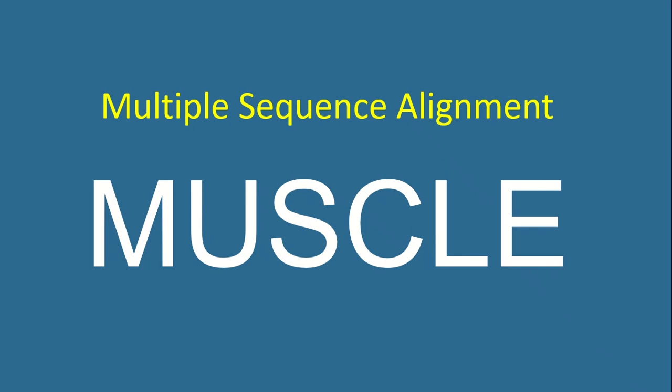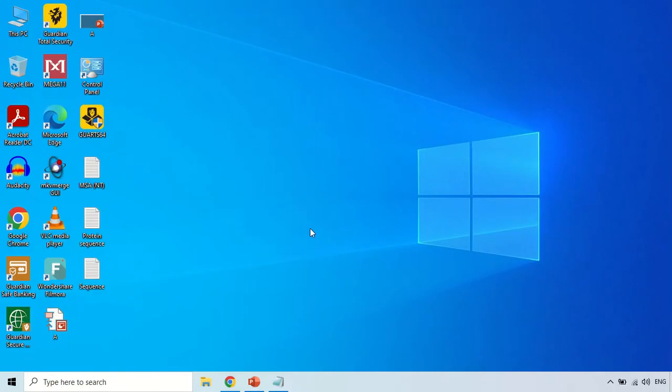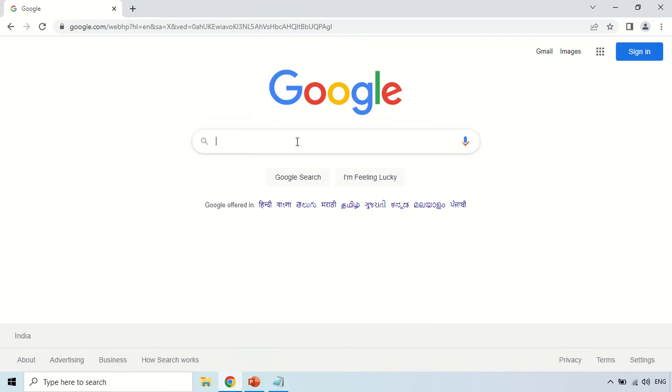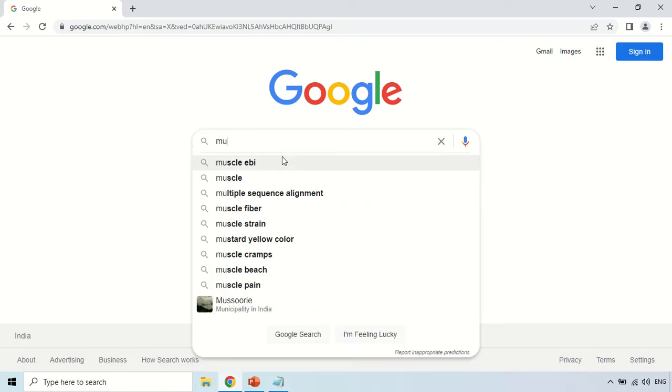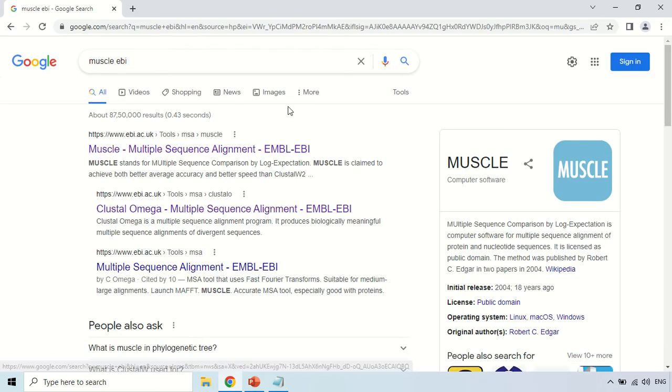Hello everyone. In this video I will show you how you can use the MUSCLE tool for performing multiple sequence alignment. In order to use this MUSCLE tool, just open your browser and search for 'MUSCLE EBI'. EBI stands for European Bioinformatics Institute because it is a tool of EBI.